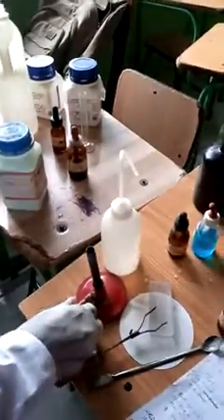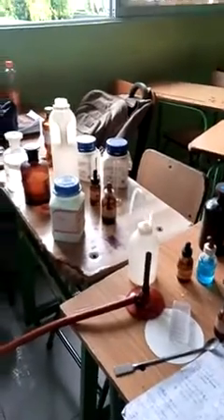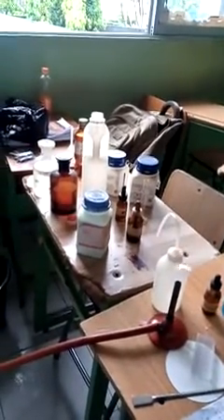What is the next question there? Heat the resulting mixture and keep for some minutes. So we are going to heat now.